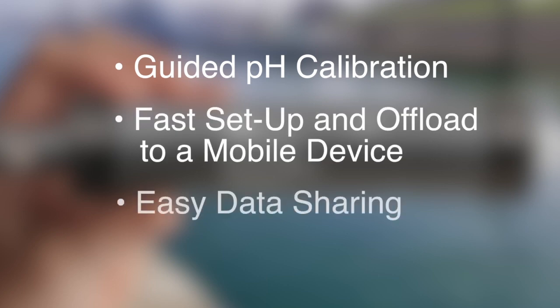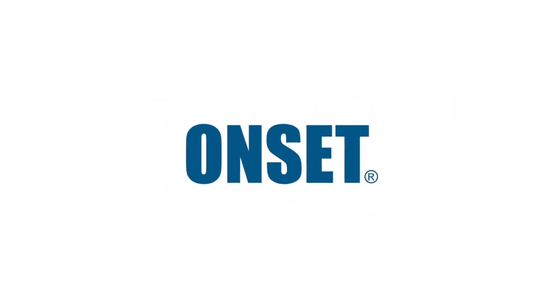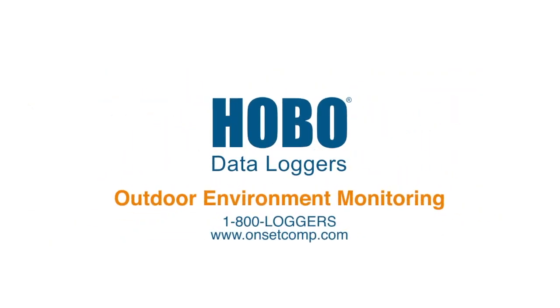With the MX2501's user-guided calibration, fast setup and offload, and easy data sharing, you'll spend less time obtaining accurate, efficient pH and temperature data with a higher temporal resolution and at an affordable price. Contact Onset today to learn how the HOBO MX2501 pH and Temperature Logger can help with your next project.